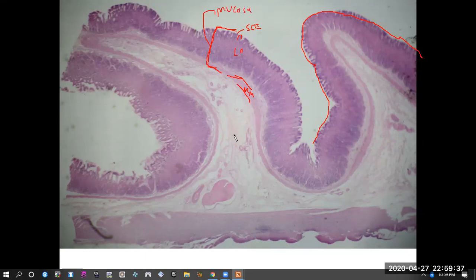We see a very wide open submucosa all the way up into the ruga as well. We have the tunica muscularis externa with its two subdivisions. And then the absolute edge, in the case of these remaining samples, the fourth tunic will be called the tunica serosa.